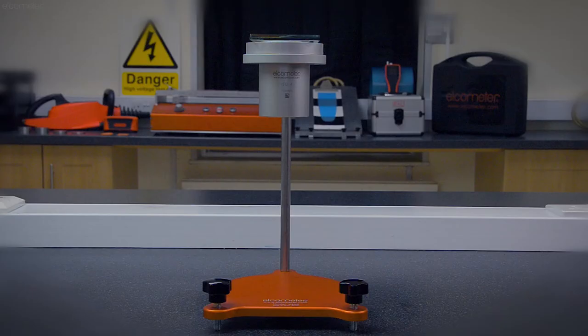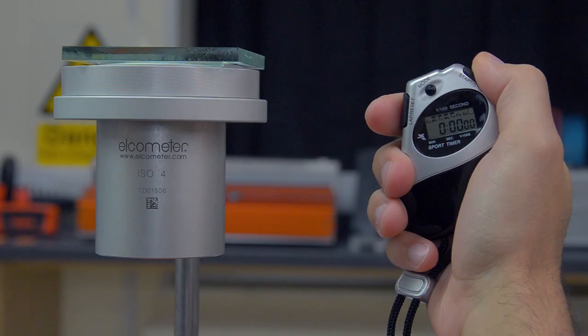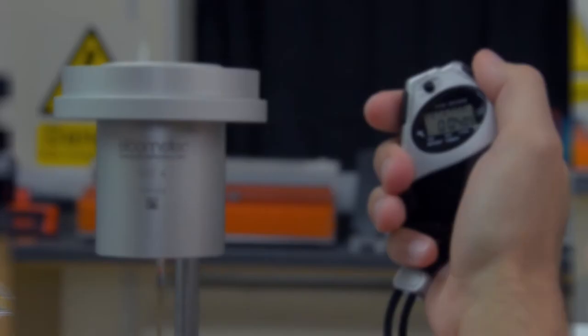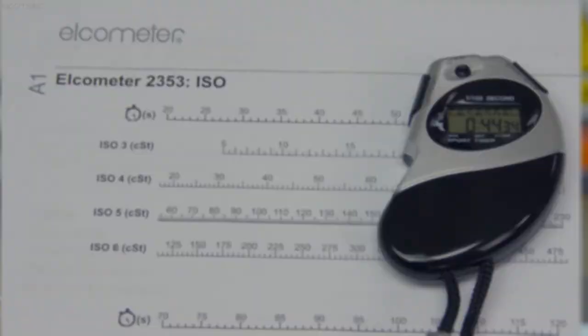Place a beaker or any suitable container underneath the cup, and have the stopwatch at the ready. Start the stopwatch at the same time as you slide off the glass plate, and watch the flow of liquid from the orifice. The moment the flow of liquid breaks for the very first time, stop the stopwatch and record the result.